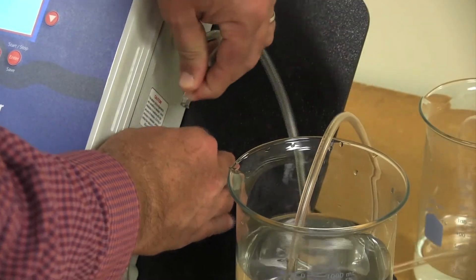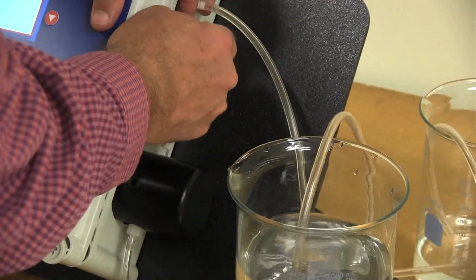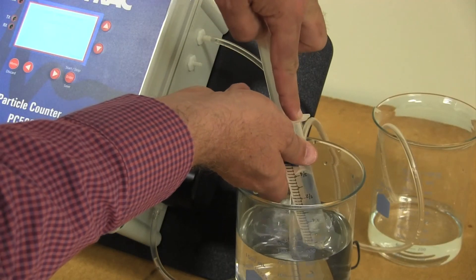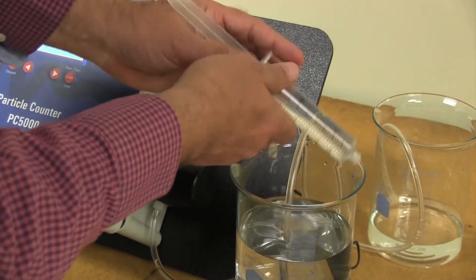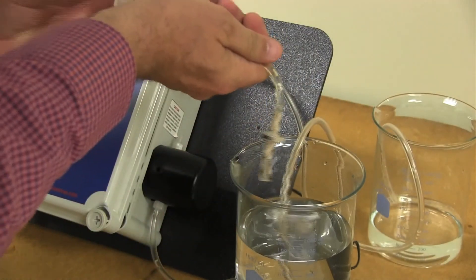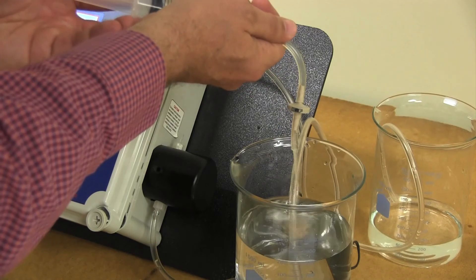An inline filter is used in the grab sample mode to protect the internal pump. After each session in the lab, it is a good practice to use a syringe to backwash the filter using particle-free water or even tap water.